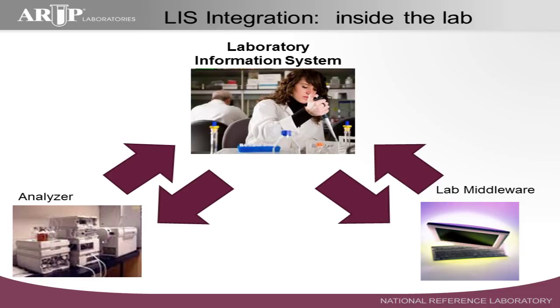And of course, something that's similar but not quite the same is middleware. Has everybody heard the term middleware used in the concept of the lab? Well, that's typically software that sits between the bench or an analyzer and the LIS. So it might do a lot of heavy-duty calculations, it might do some QC work, and they typically refer to that as middleware. It sits between the analysis process and the laboratory information system.